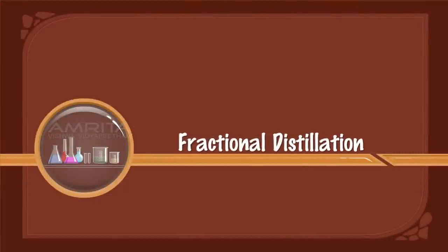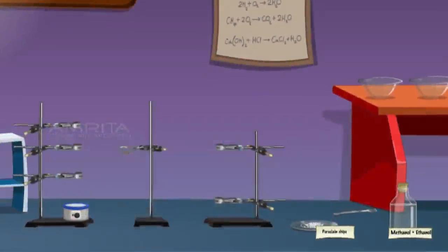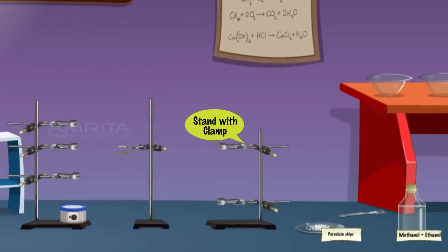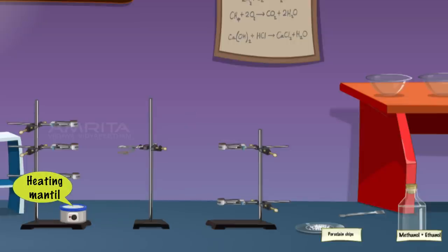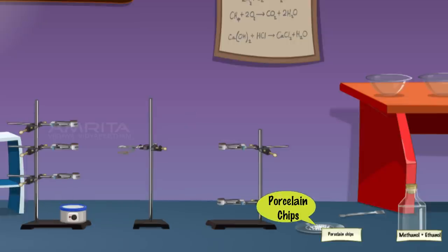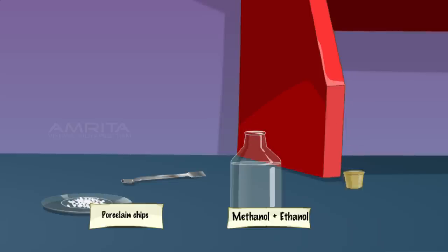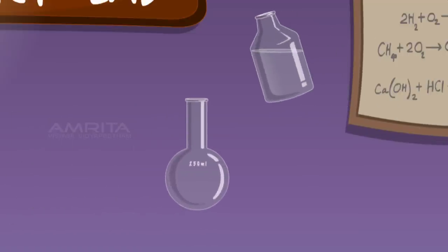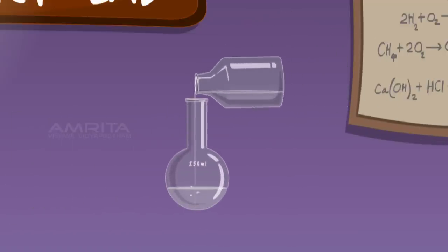Fractional Distillation. We require a mixture of methanol and ethanol, stand with a clamp, heating mantle and porcelain chips. Take a mixture of methanol and ethanol and pour it into a 250 ml RB flask or distillation flask.